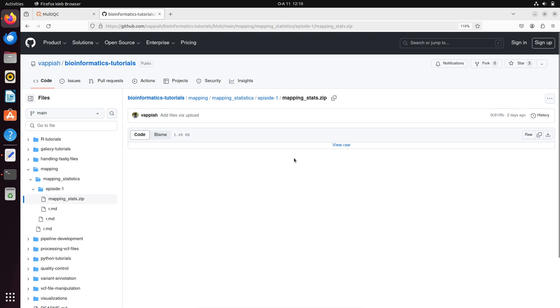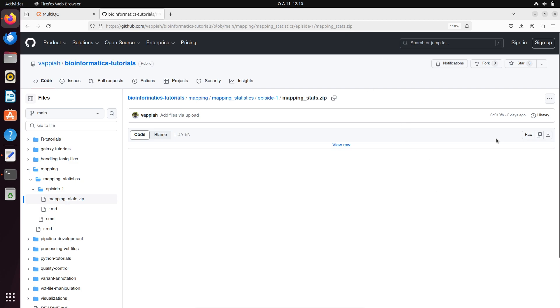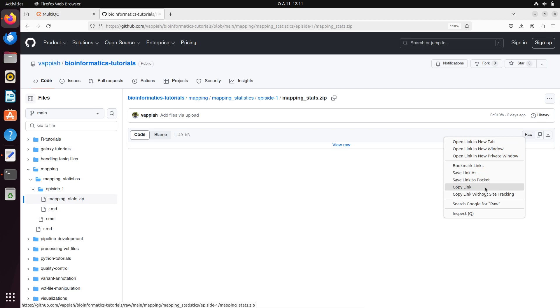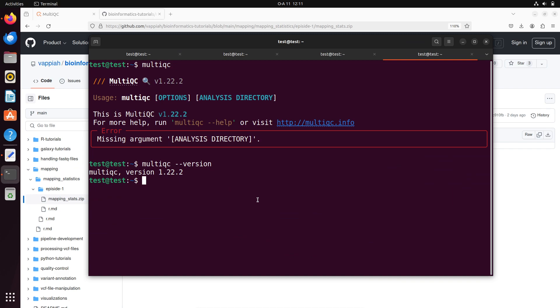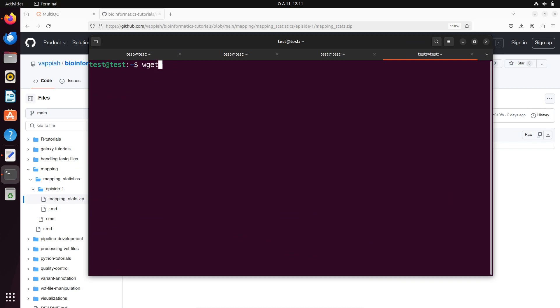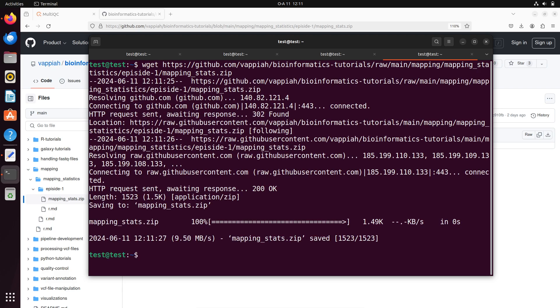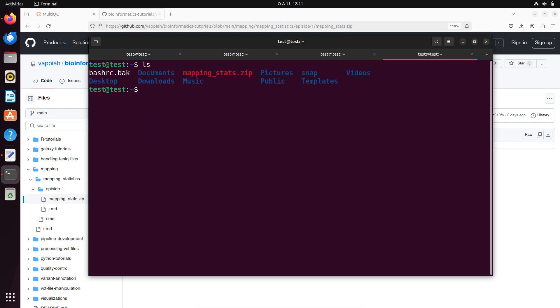When you click the file, you get to a page where you can download it using the download arrow button on the right side. If you are working on a remote Linux cluster without browser access, right-click the 'Raw' button, copy the link, go to your terminal, and run 'wget' with that link pasted in. Hit Enter to download — it's a very small file. Then run 'ls' and you should see 'mapping_stats.zip'.